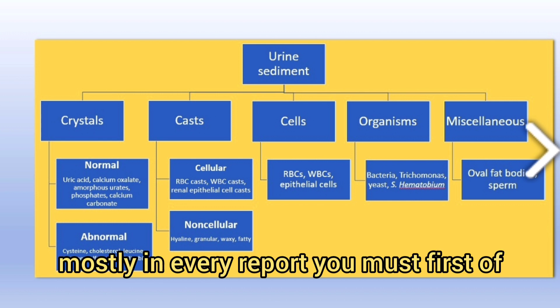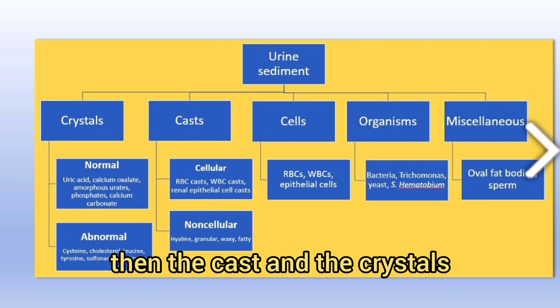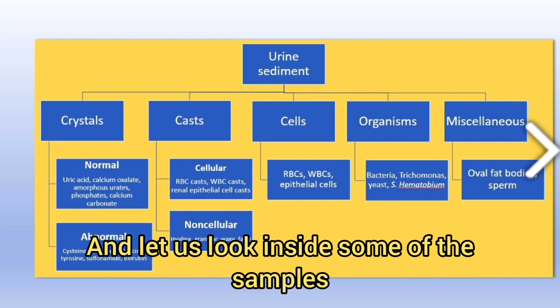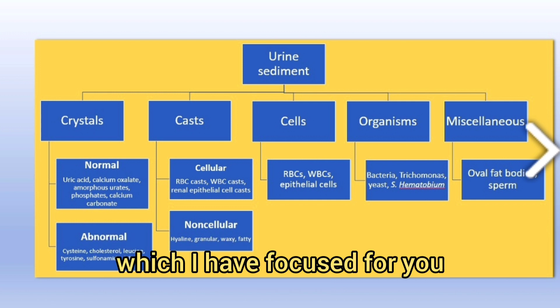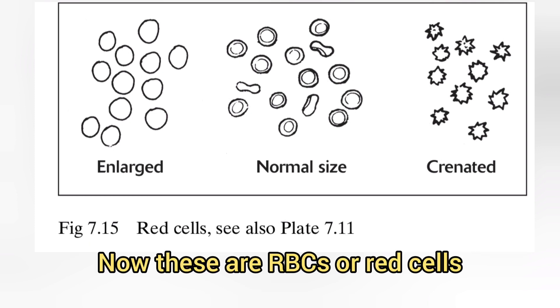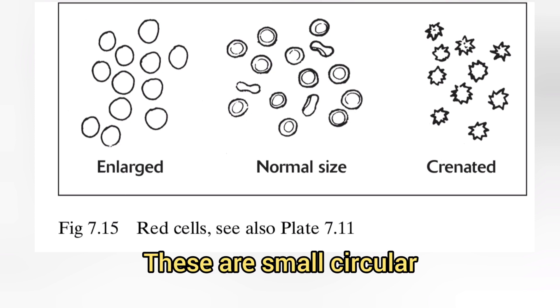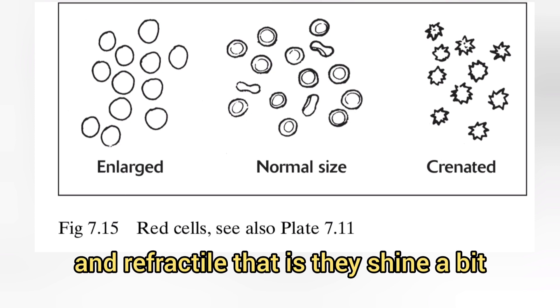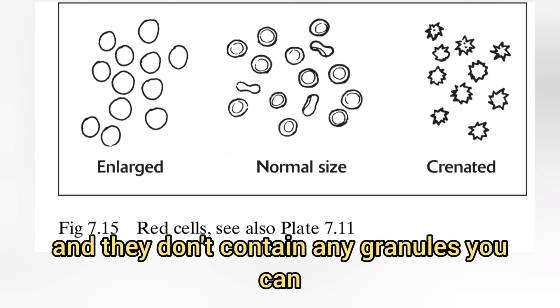In every report, you must first report the cells, then the casts, and then the crystals. Let's look inside some of the samples. These are our RBCs or red cells — they are small, circular, and refractile, meaning they shine a bit, and they don't contain any granules.